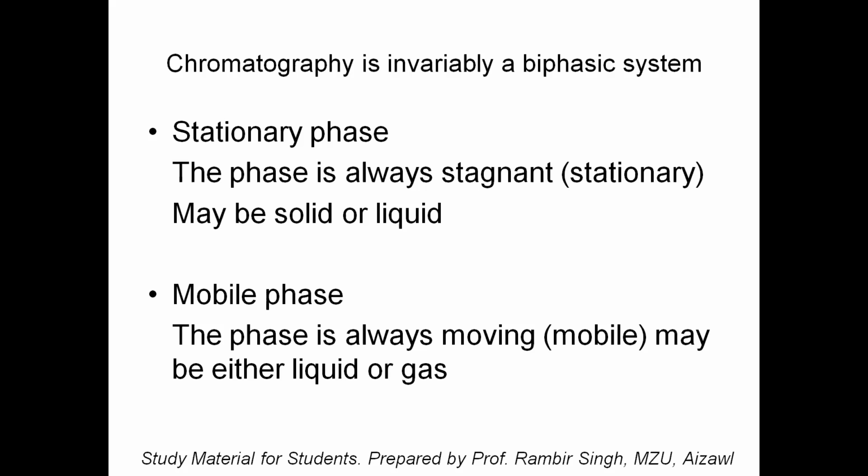And then simply open the container, the lid of the container. Then what will happen? When you open the lid, carbon dioxide will come to atmospheric pressure, and at atmospheric pressure, carbon dioxide is a gas. So what will happen?